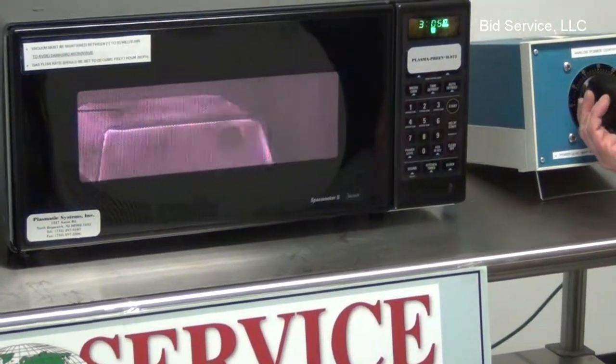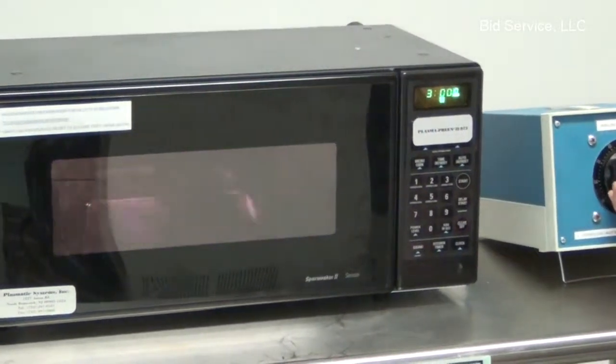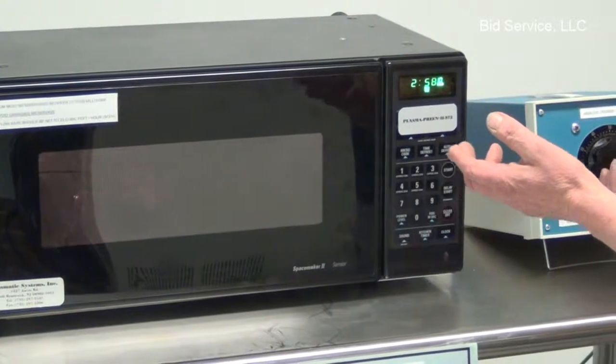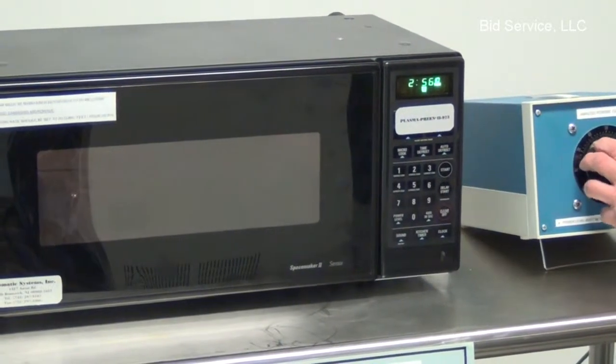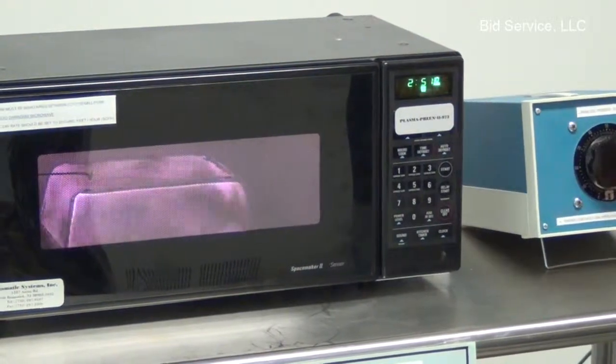So if we start to turn it off and we get past 70%, we'll start to lose our plasma. But between 70 and 100% is a normal operating range.